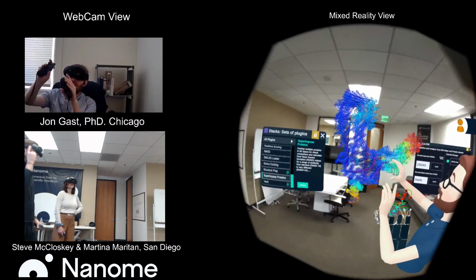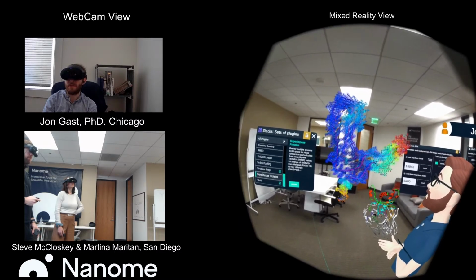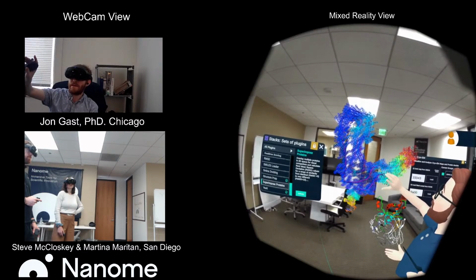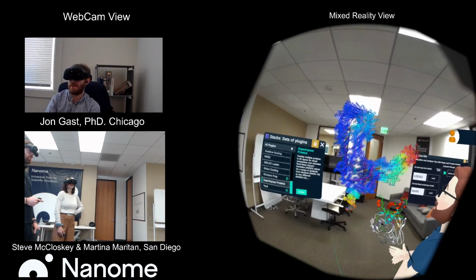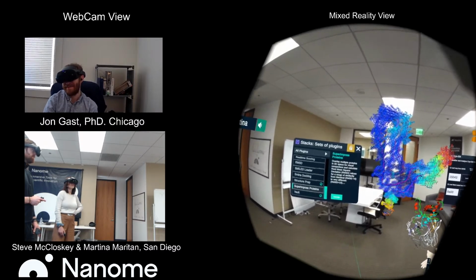Really, we wanted to get the overall visualization kind of squared away, and then we also are considering different things, both with how the overlay is actually within the map, as well as being able to actively work within the map. So stay tuned for any news there.